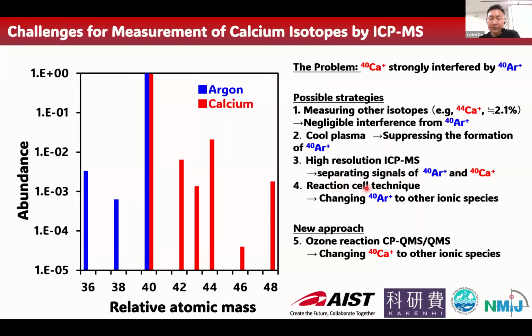And there are reaction cell techniques changing argon to other ionic species. Here we provide a new approach, changing calcium to other ionic species based on ozone reaction ICP-QMS.